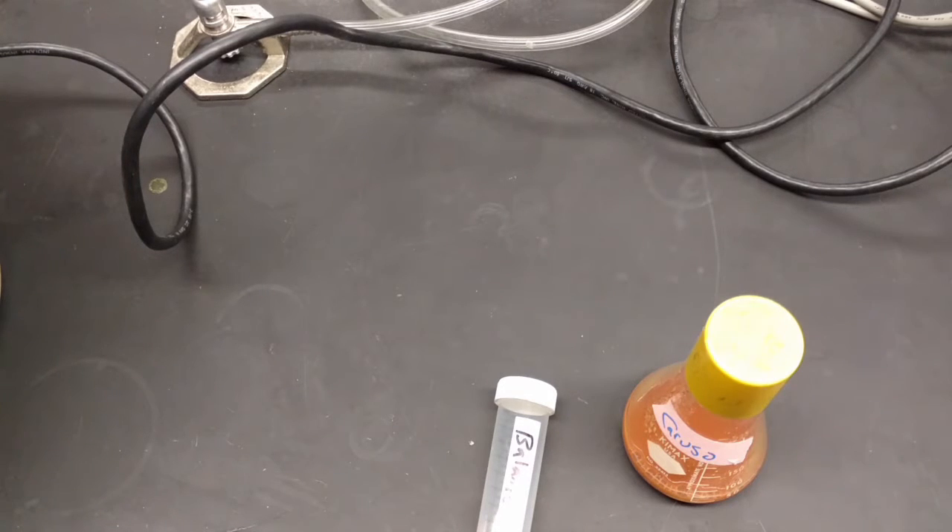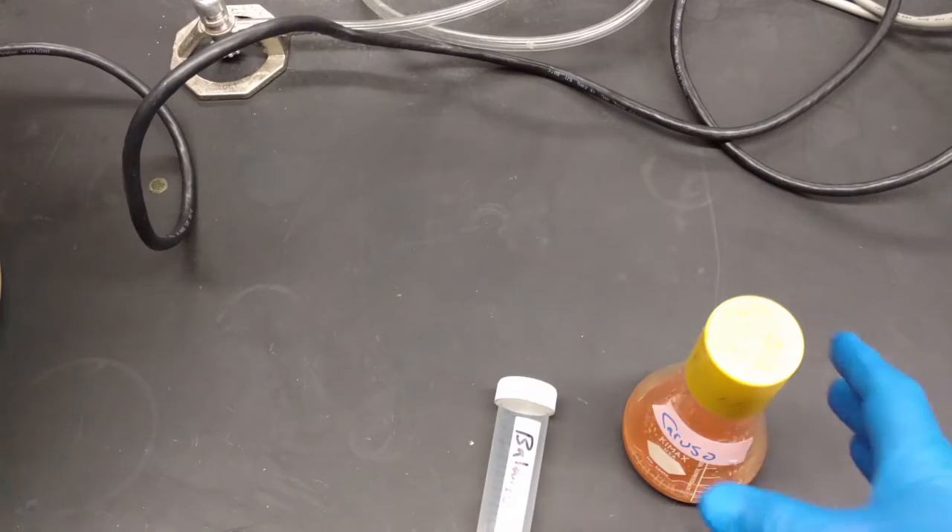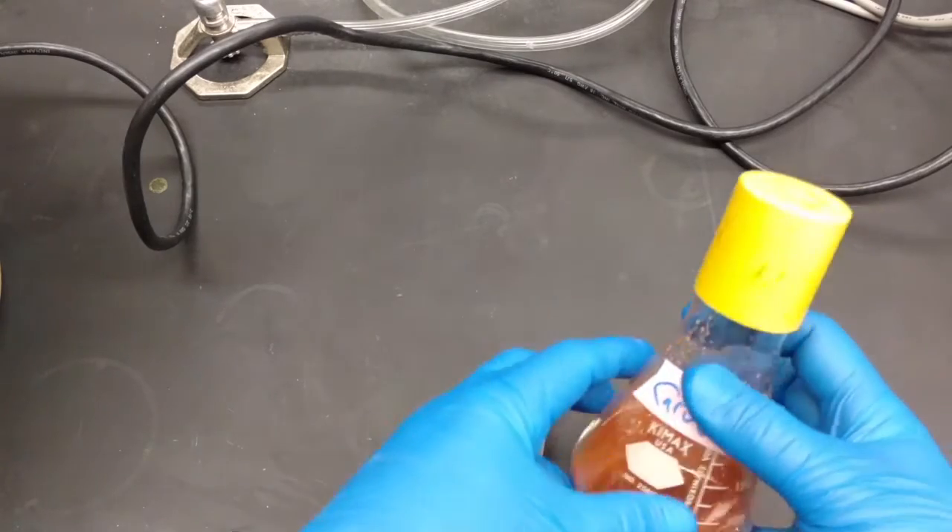Hello and welcome to how to continue your enrichment. So you started your enrichment yesterday — you added a gram of your soil sample, five mils of your bacteria, and 45 mils of culture media, whatever bacteria and culture media you needed to use, to a 250 mil flask like this.